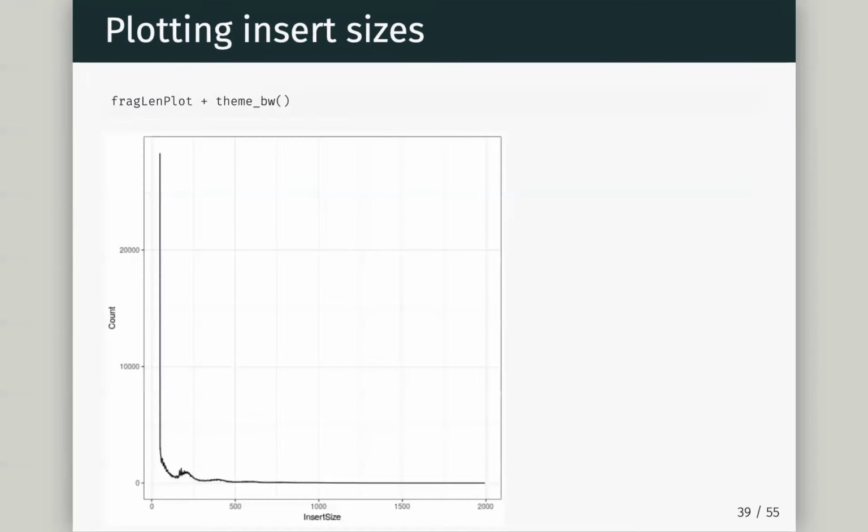If you put that onto the log scale, it starts to become way more apparent. So same plot, plus scale_y_continuous, and we'll do log 2 here. If you look at that now, you can see mono, di, tri, 4, 5. So you can really see the evidence of this. And this is just looking at 1 chromosome. This looks, I think, identical to what the Greenleaf paper pulled out. So that's great. We can reassure ourselves that this method we've reconstructed using Bioconductor is the same.